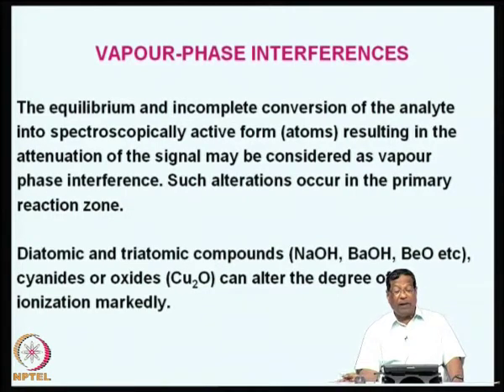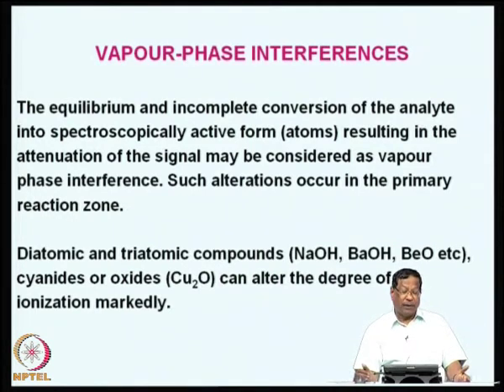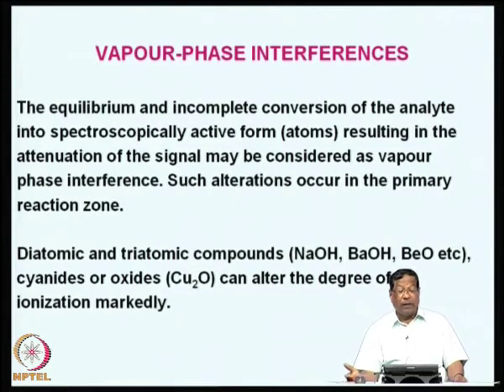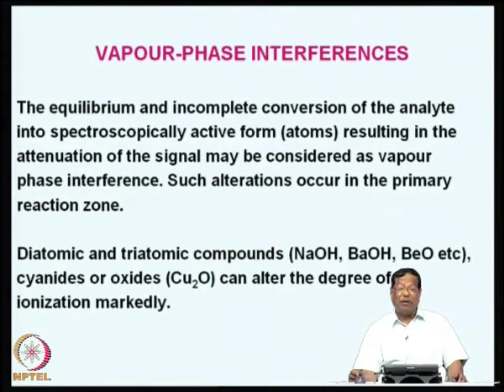The equilibrium and incomplete conversion of the analyte into spectroscopically active form—that is, atoms—resulting in the attenuation of the signal may be considered as vapor phase interference. Metal atoms formed need to get into the vapor phase system. Equilibrium and incomplete conversion are the only factors that can change the concentration of atoms in the vapor phase, and such alterations usually occur in the primary reaction zone.